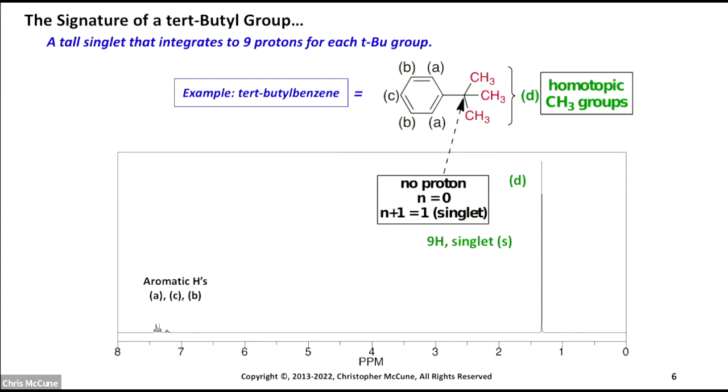Okay, so if you look over here, I've got 3 peaks in a 2 to 2 to 1 H ratio for this integral, around 7 to 8 in that range, okay? And there are fewer hydrogens spaced out over those patterns, and so they just look smaller in comparison to the tert-butyl, okay?